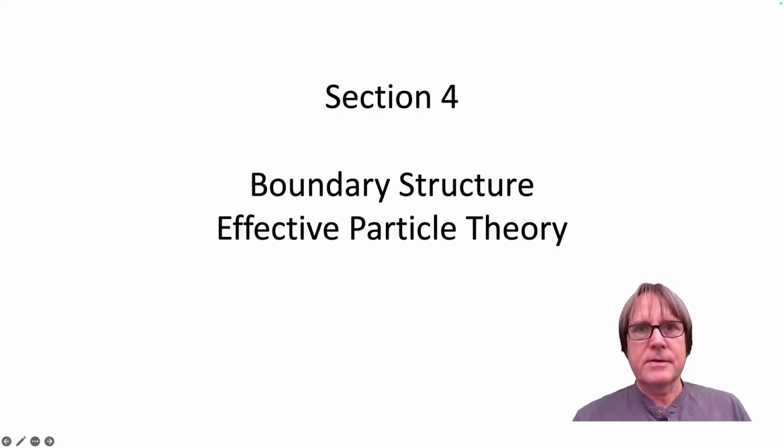So now we are ready to dive into the key question, what is really going on in these mysterious reaction boundaries? This will lead us to the concept of an effective sedimenting particle and then help us to develop a quantitative analysis that allows us to take advantage of the boundary structure.